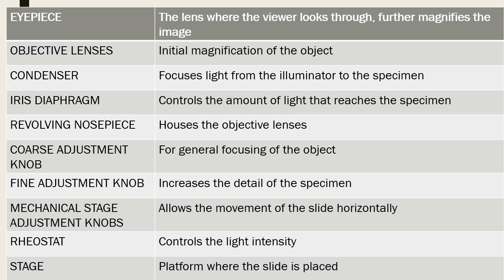A typical magnification in the eyepiece of a compound microscope is at least 10 times.